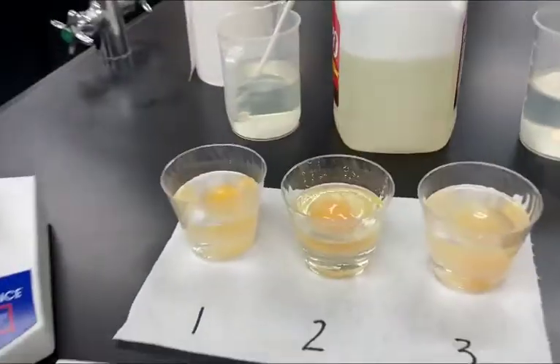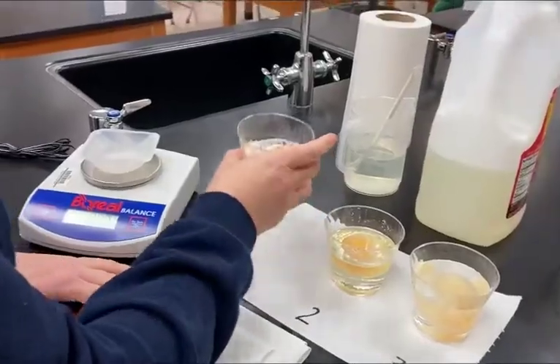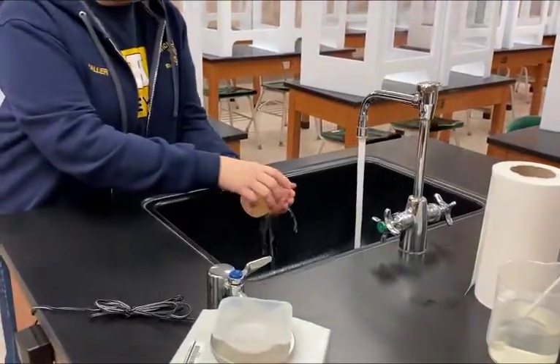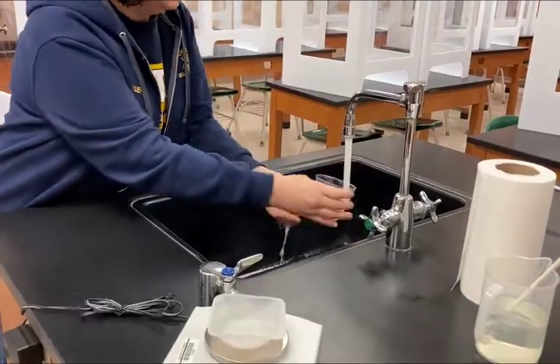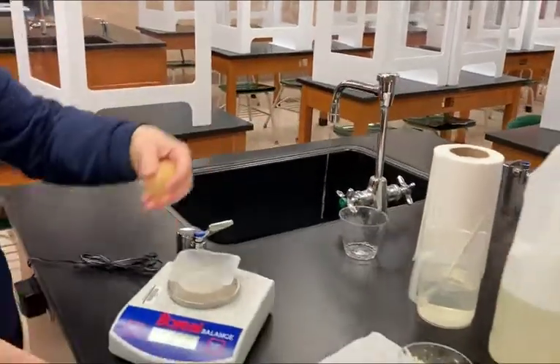The last part of the lab is that we're going to take these eggs out of their solutions, rinse them off, dry them off, and mass them. We'll take them over to the sink, dump the solution, rinse the egg gently, dry them off, and take their mass.